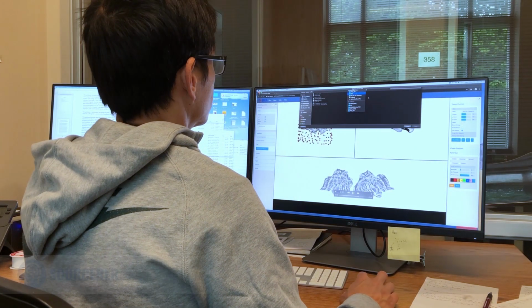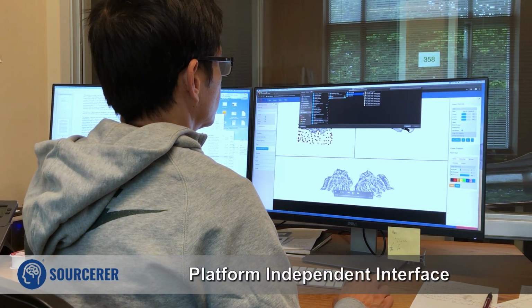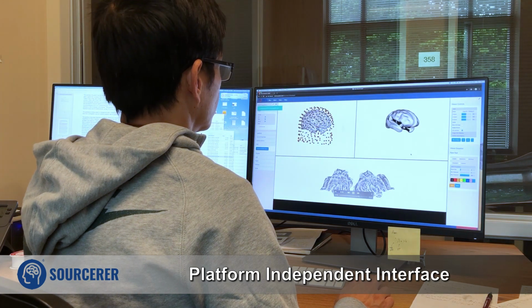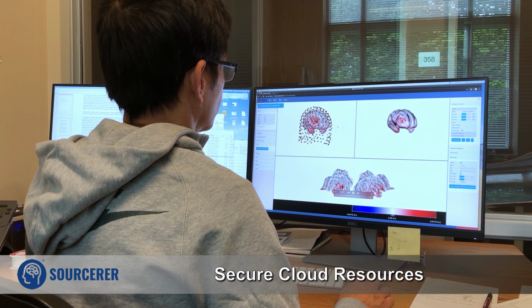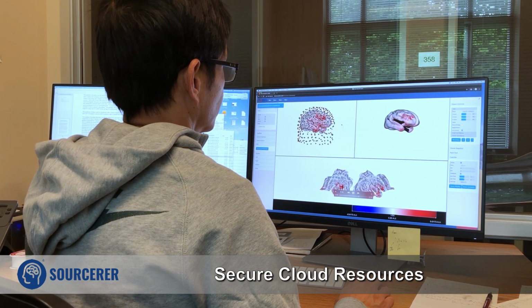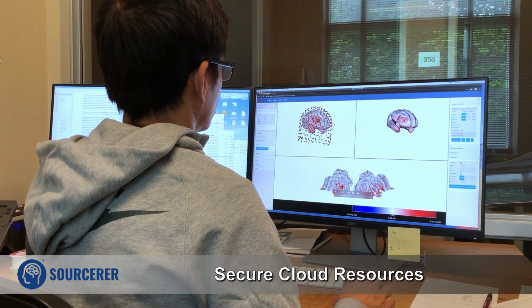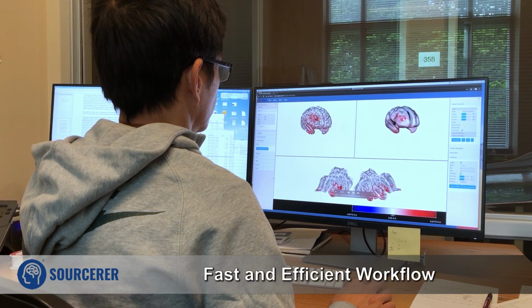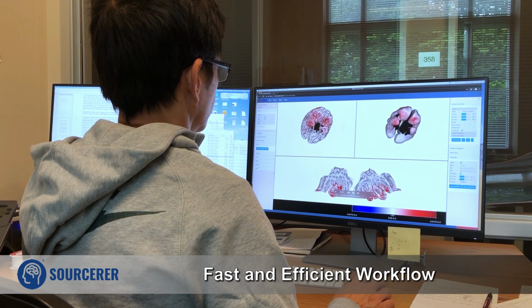With cloud services technology through AWS, we're able to deliver a platform-independent interface through local visualization code contained securely within the Chrome web browser. Through standard RESTful web interfaces, users can access their secure laboratory database from any internet connection location and draw on the computational resources of the secure cloud. Computations are completed by the cloud ahead of time so that when the researcher is ready to explore the data, the workflow is fast and efficient.